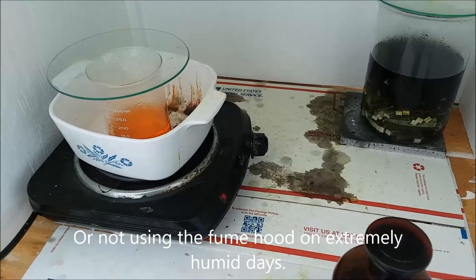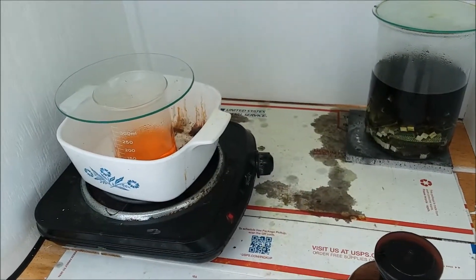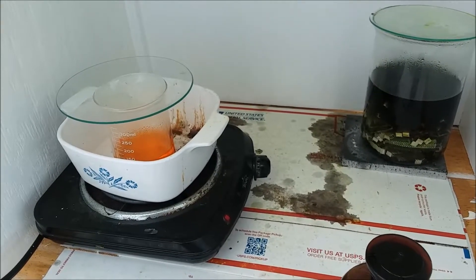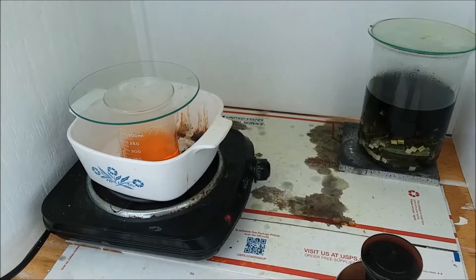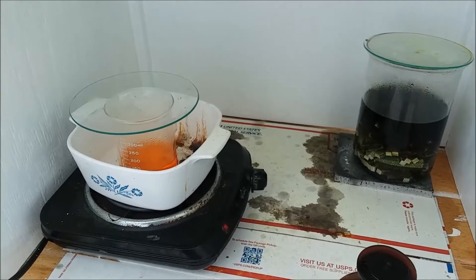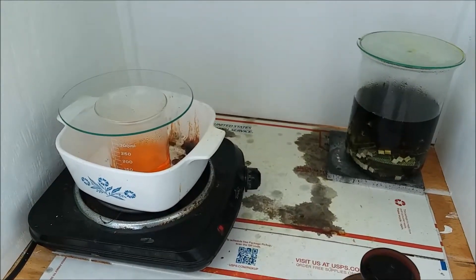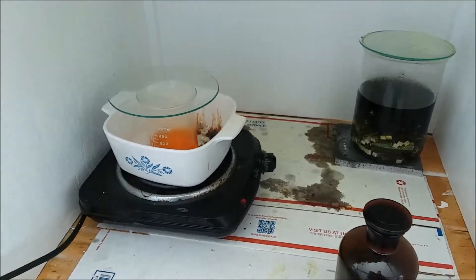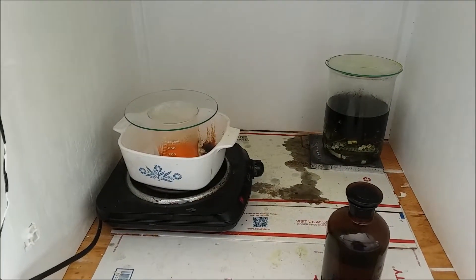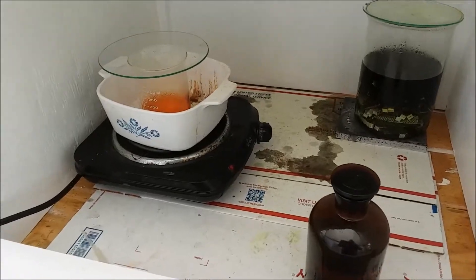It's not without its warts. I've used it heavily today — I've dissolved a lot of stuff. There's been a lot of hydrogen chloride, a lot of nitric acid, a lot of sulfur dioxide, and all of it has been caught by the fume hood. It hasn't been going in my lungs or in my face.